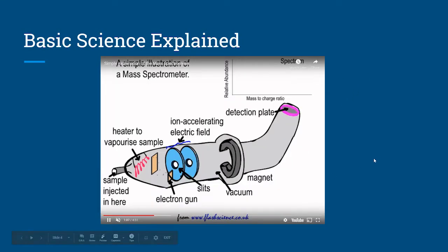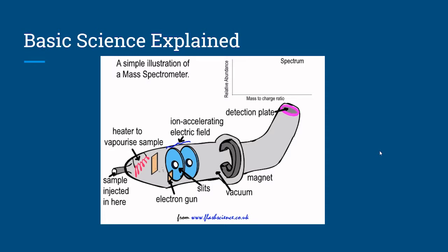So here we see the sample is placed into a vacuum chamber to become vaporized by heat and then ionized. Ionized substances are accelerated by shooting them from the vacuum chamber into a powerful electrical field. The ions are separated this way based on the charge they have. Highly charged equals high acceleration and vice versa.